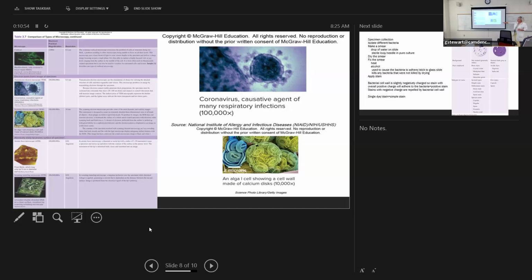This is an algae, a diatom that you might have looked at under the microscope back in Bio 1, right? I don't think we had this particular diatom, but I think you can see really easily these calcium or silicon discs, I guess they're calcium in this one, that are laying around the top of the organism, which is soft bodied and inside of that you can't see, right?